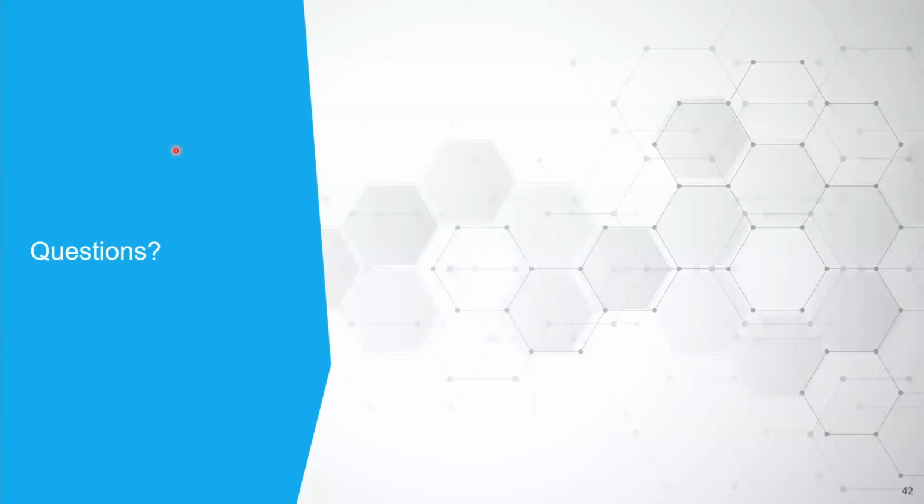He was asking what type of compounds are better suited for MS or NMR, and he also says there are a lot of examples with organic acids. Would a study looking at those types of molecules perhaps be better suited for NMR versus MS, or are they equal?